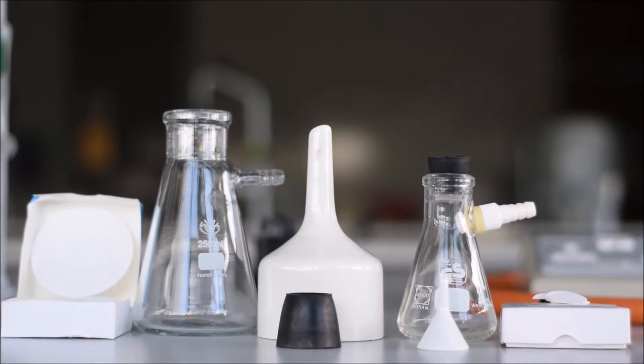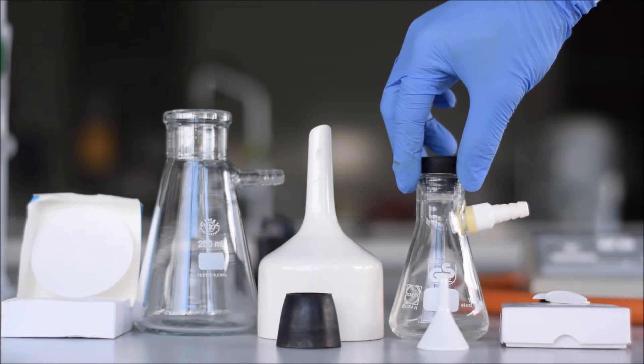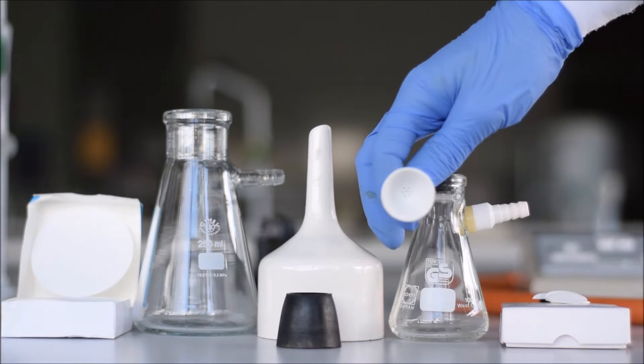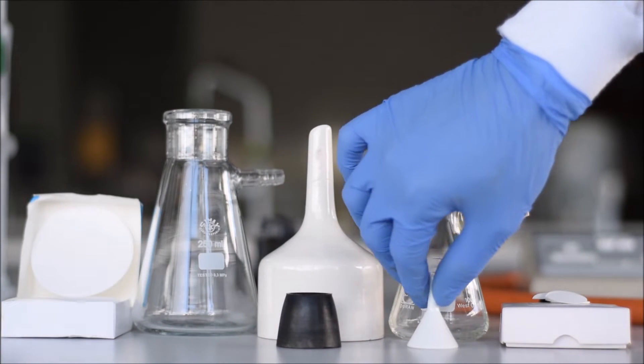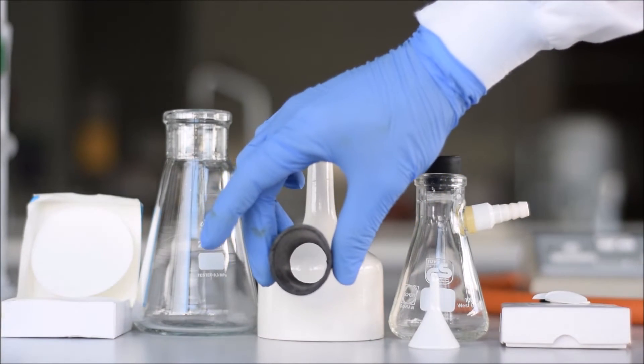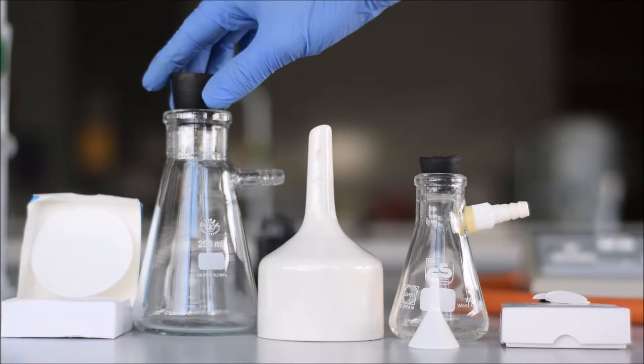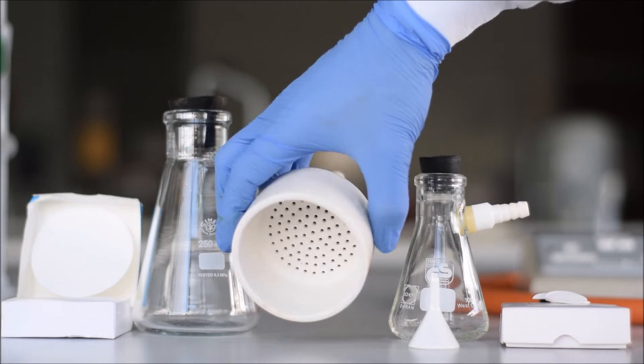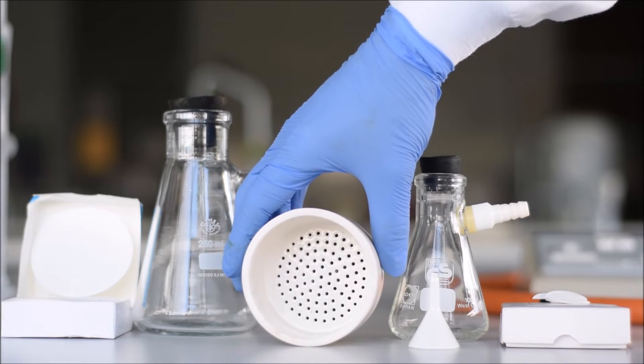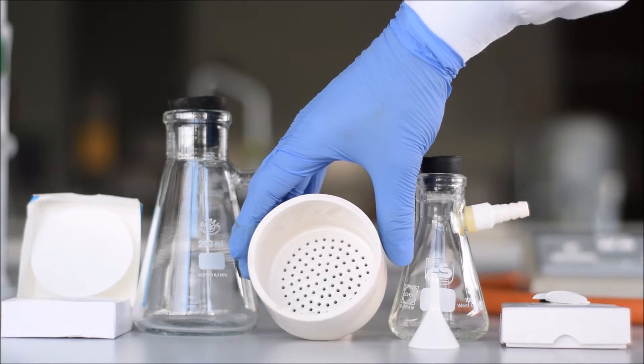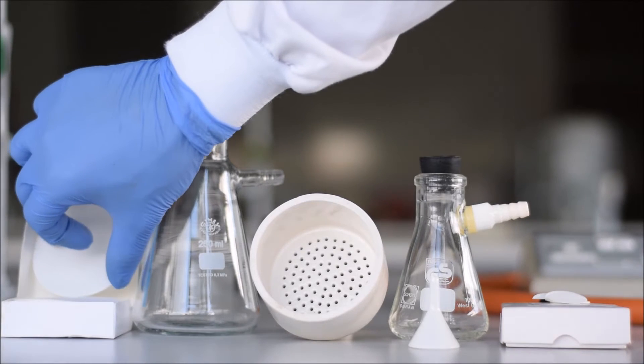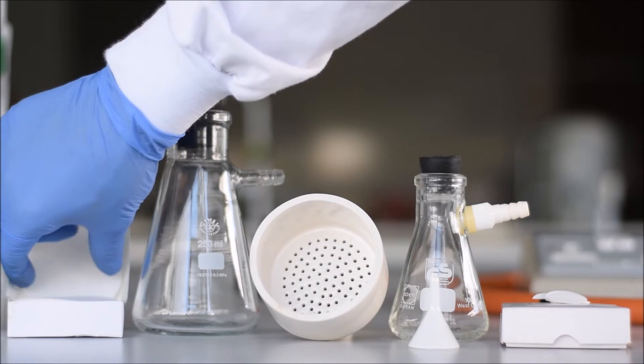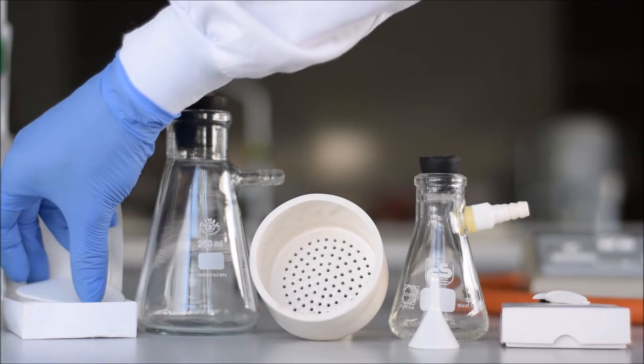The third option are Buchner funnels and Hirsch funnels. This tiny funnel you see here is called a Hirsch funnel and its bigger brother is called a Buchner funnel. Buchner funnels and Hirsch funnels both use Buchner flasks, which are conical flasks with the sidearm that are specially reinforced to withstand the vacuum. The black rubber ring you see is otherwise known as a gasket and it allows you to form a vacuum seal between the funnel and the conical flask.